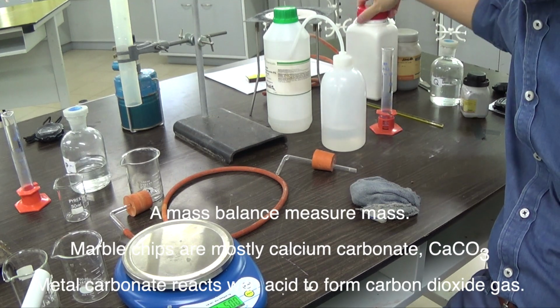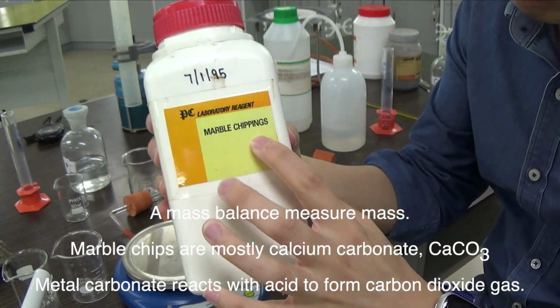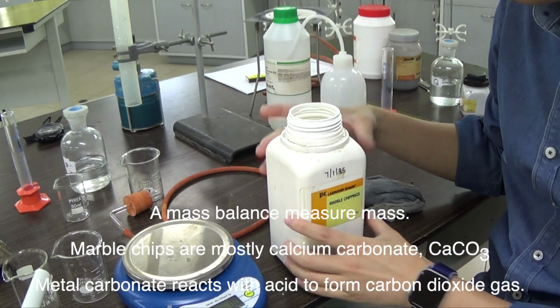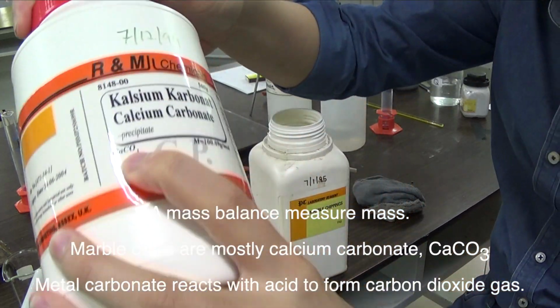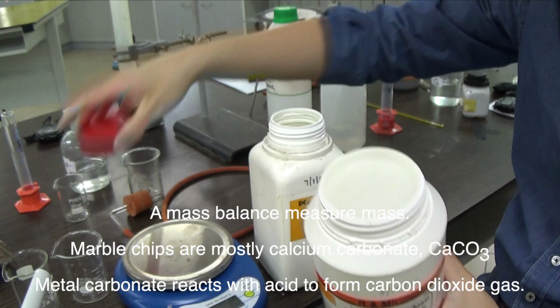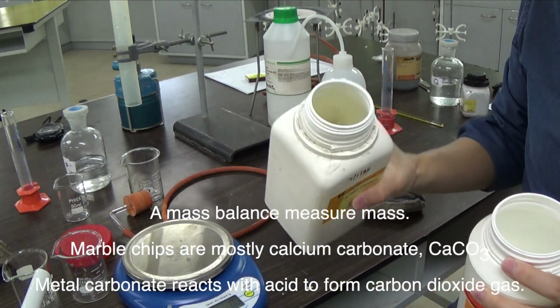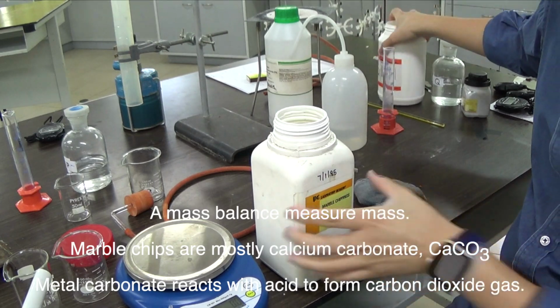Okay, so what I have really is marble chips. Marble chips here actually refers to calcium carbonate, calcium 2+ and CO3 2-, which gives the formula CaCO3, calcium carbonate. But this is the powdered form of calcium carbonate. So it's already powdered. But this one is the marble chipping. They are solid. So we're going to investigate surface area.